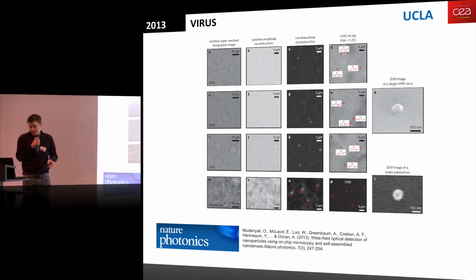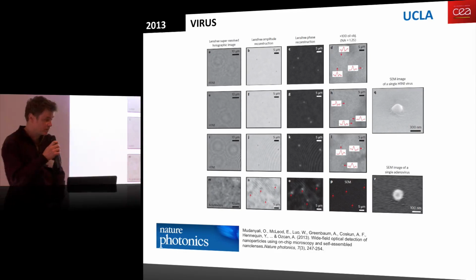So with this device, we paved the way maybe for a new means of diagnostics to measure the viral load assay or the bacterial load assay.